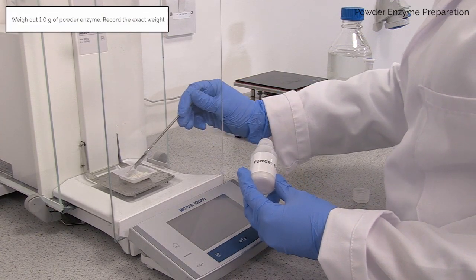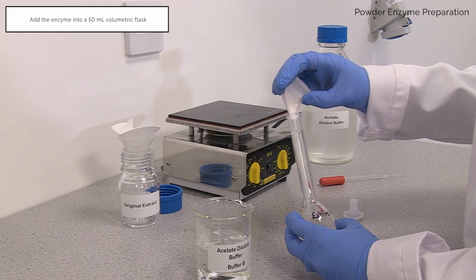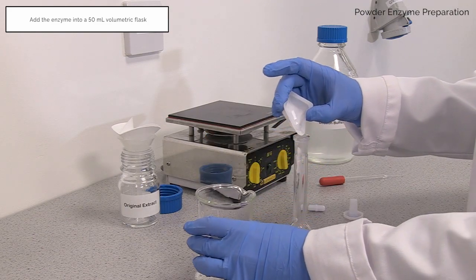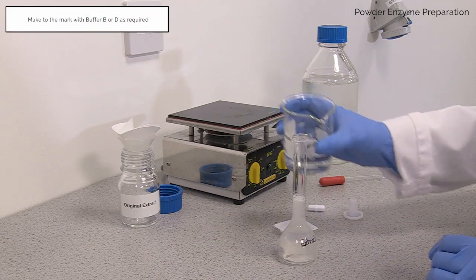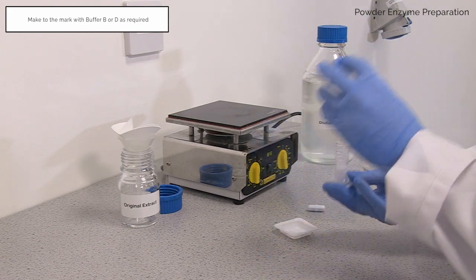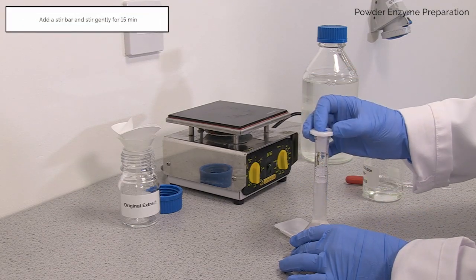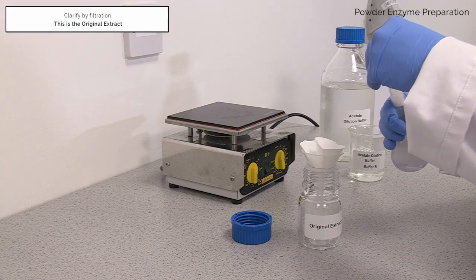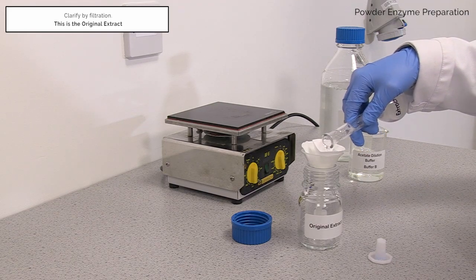Weigh 1 gram of powder enzyme into a weigh boat. Record the exact weight and add to a 50 millilitre volumetric flask. Make up to the mark with dilution or extraction buffer, either buffer B or D as required. Add a stir bar and stir gently for 15 minutes. Clarify by filtration into a 100 millilitre Duran bottle. This is the original extract.